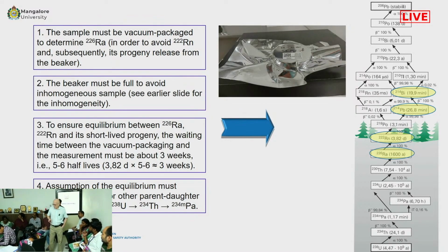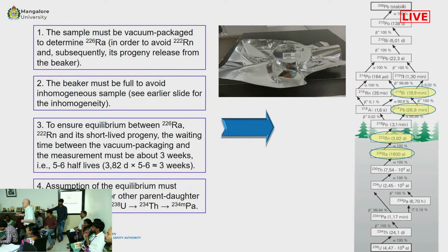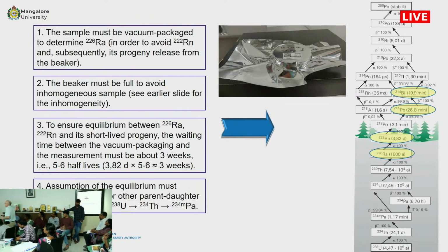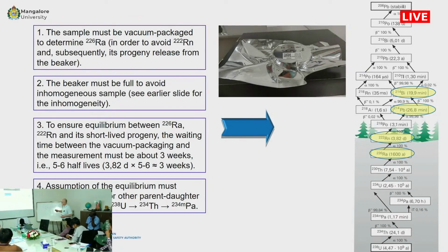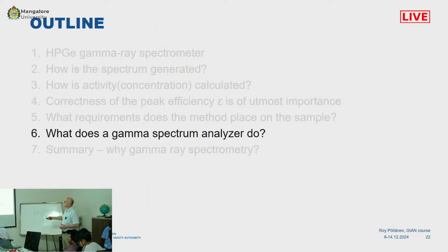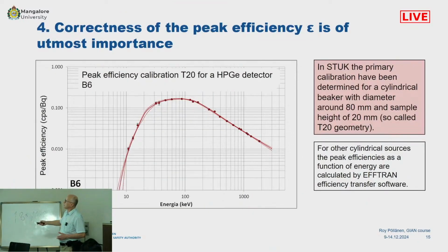Not necessarily. Let's go back. So he asked about the efficiency calibration of radium-226. Let's go here.